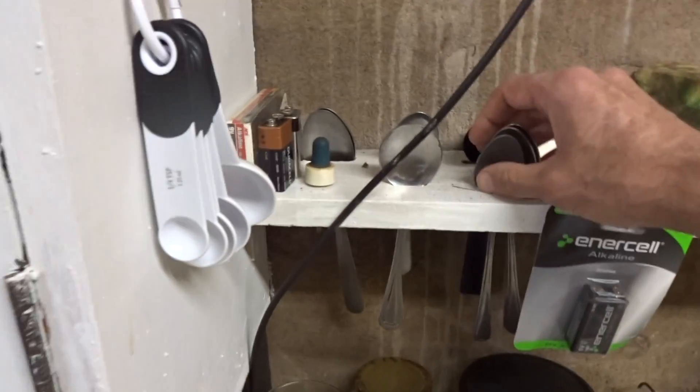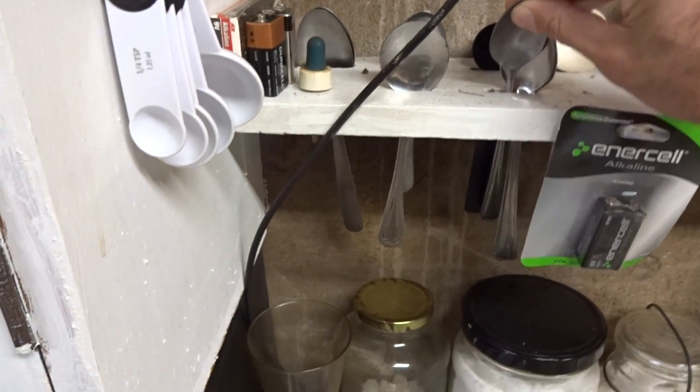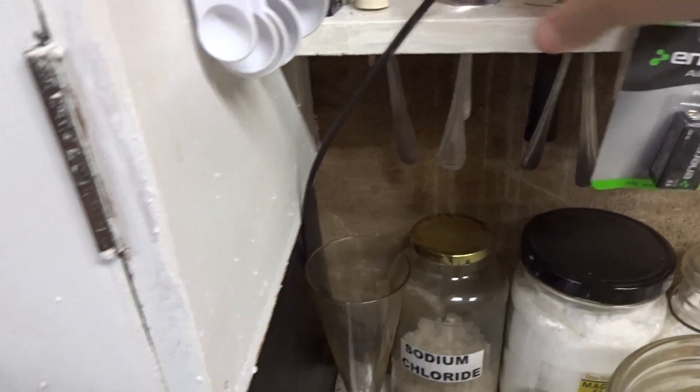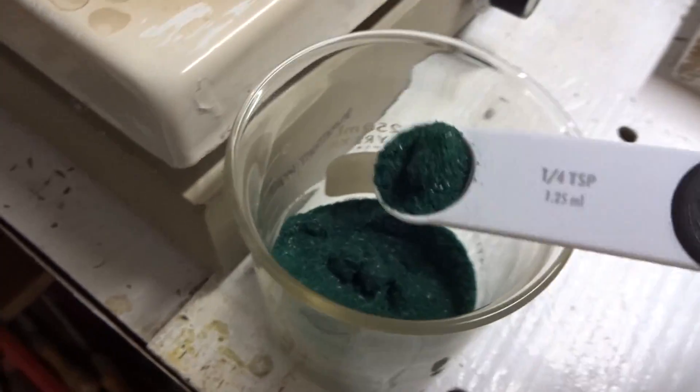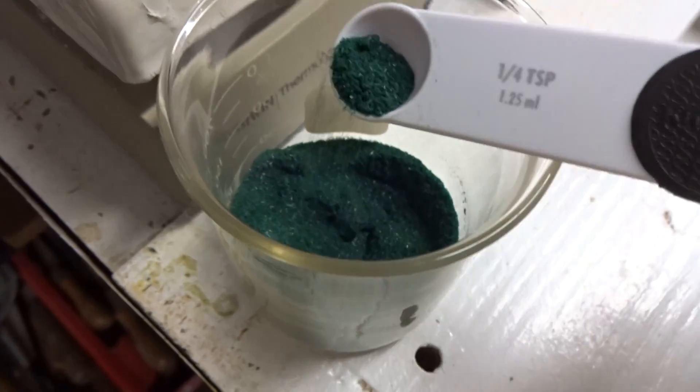We need to separate some crystals for a seed. What we're doing here is we're going to cause this reaction to go to super saturation. That's why we're heating it up.